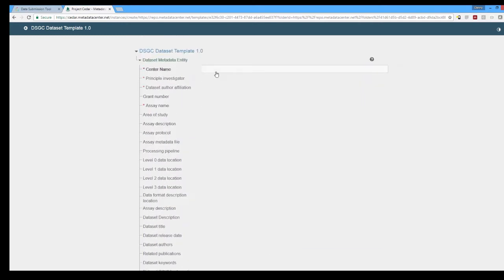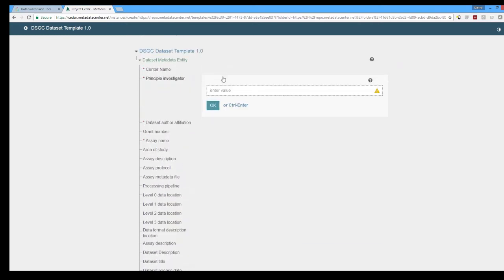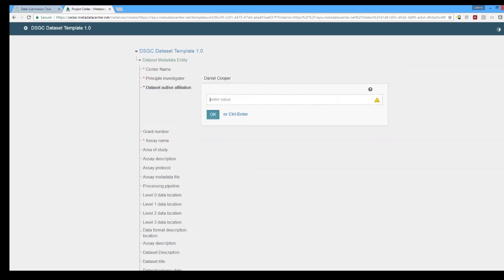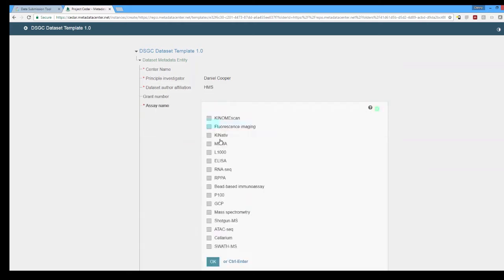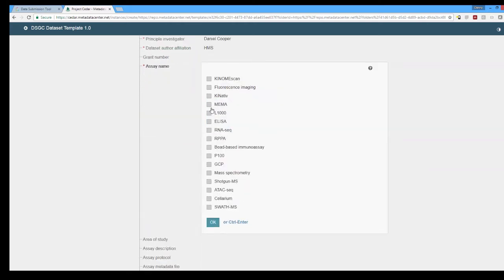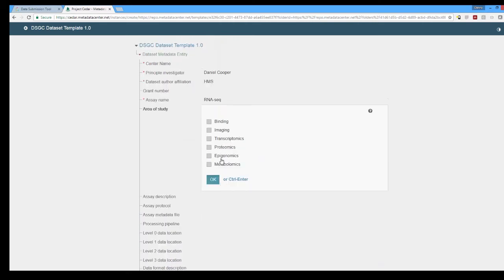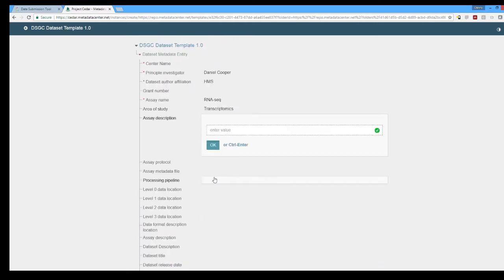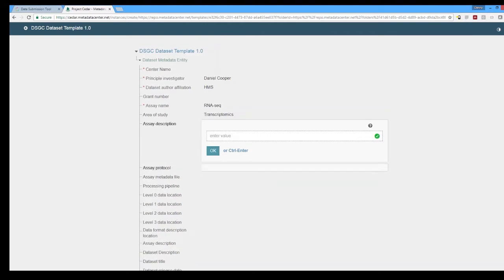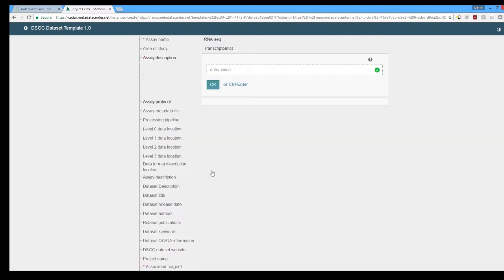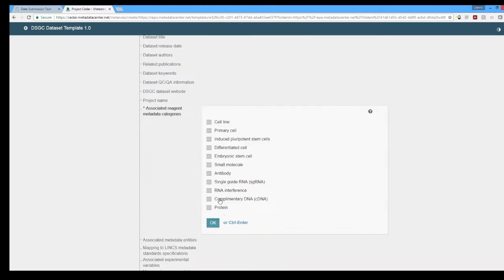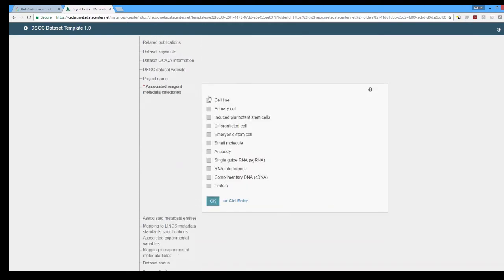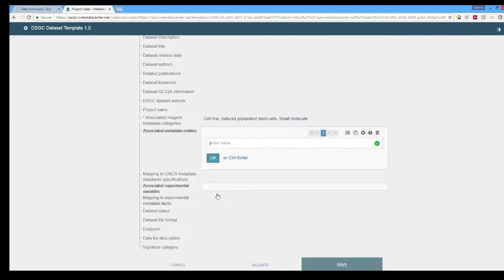We'll go ahead and fill out most of them but not all of them because we have a validation service through the Lynx DCIC API and a validation server on our side. Here we will be selecting RNA-seq through a checkbox which will indicate which of the templates we need the DST to pull in order for us to complete this particular dataset. Same thing here for the associated metadata reagents. Once we select those the DST is going to know which templates we will need.